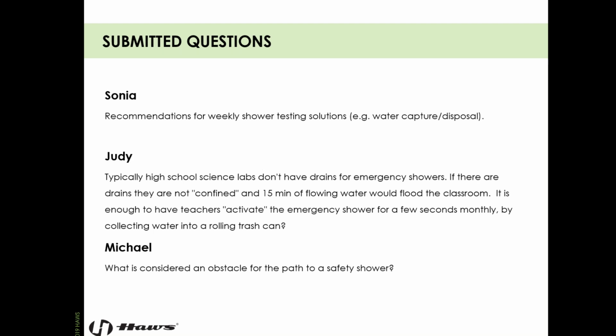It's a lot of water and you've got to control it into the bucket to do a real test, but making sure that you don't make a mess too. The shower sock is super useful, but just something to capture the water with. Maybe a smaller bucket if you have an eyewash or eye face wash drain at the bottom of like a pedestal or something like that. But our 9011 test kit is really actually pretty nice. I would consider looking into that.